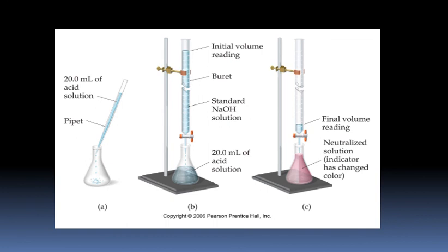And you will usually see the end of a titration by an indicator, which is an additional compound that is added to basically either change color, turn the solution a different color, or make the solution go colorless to signify when you should no longer be adding any more solution from your burette.